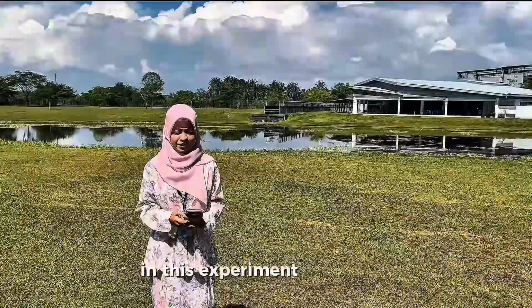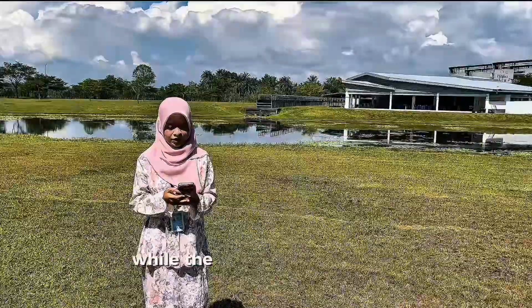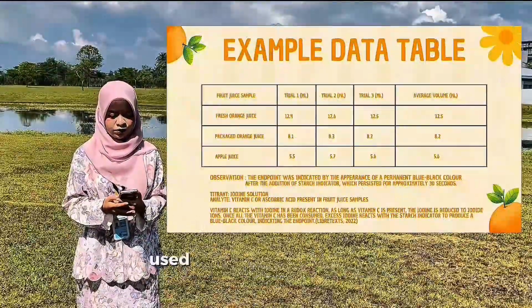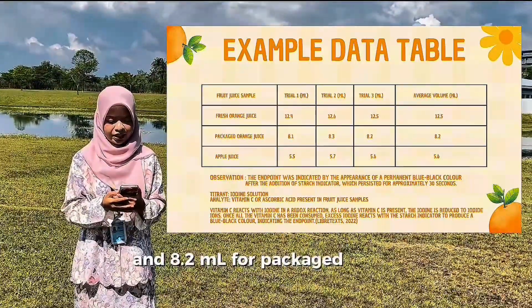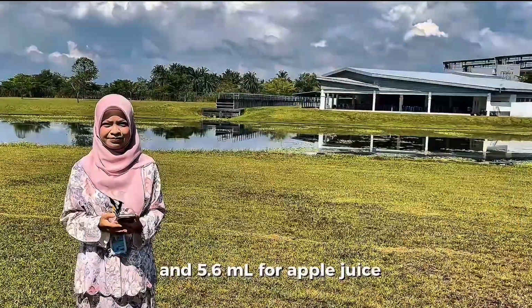Today I'll be presenting the results, example calculation and the interpretation of results for the determination of vitamin C in fruit juice by volumetric analysis. In this experiment, the analyte was the vitamin C present in the fruit juice, while the titrant was the iodine solution added from the burette. The average volume of iodine used was 12.5 ml for fresh orange juice, 8.2 ml for packaged orange juice and 5.6 ml for apple juice.